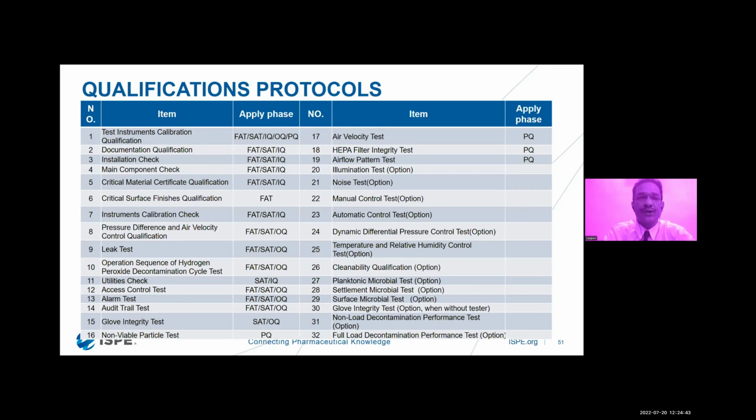But once the machine is shipped to your premises, it is going to travel by sea for a long time, and there will be a lot of loading and unloading happening at the docks. So maybe some of the instruments, though they are still in the calibration range, may go out of calibration.